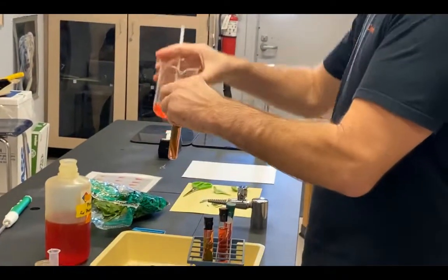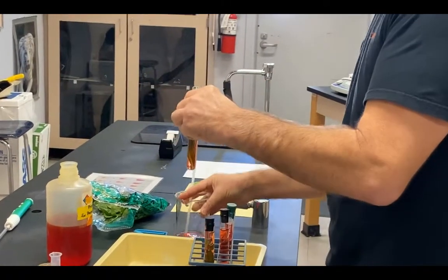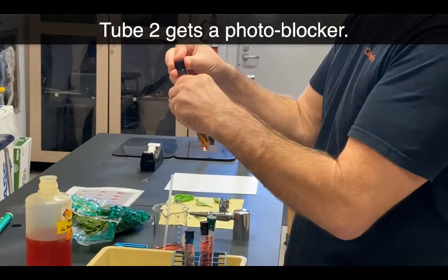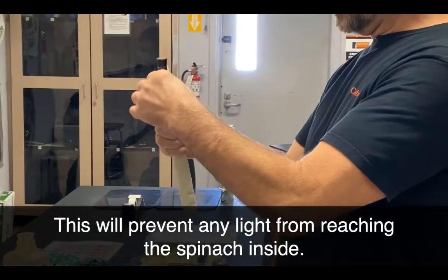I'll top off tube number 2. I'll place this in a photo blocker.